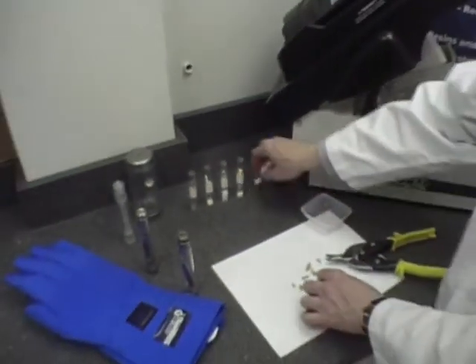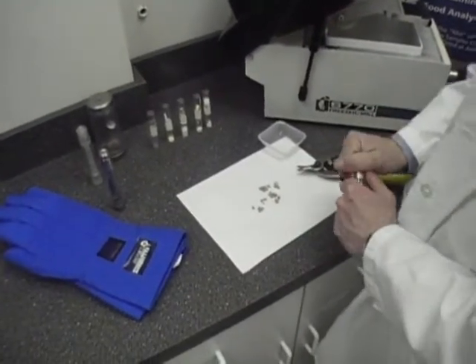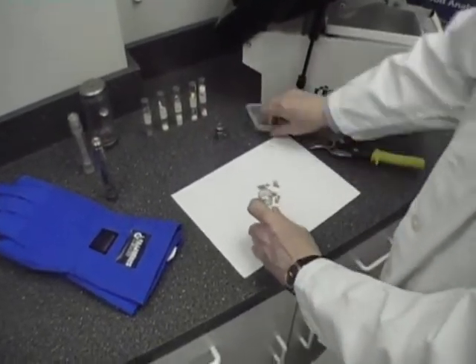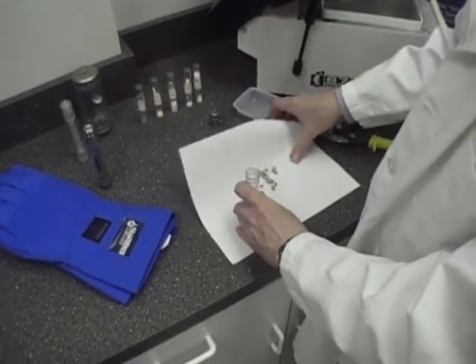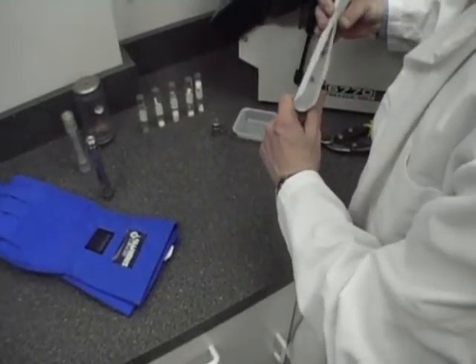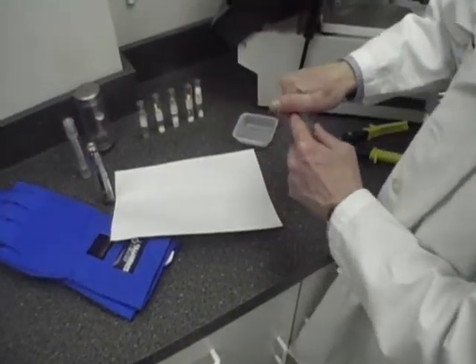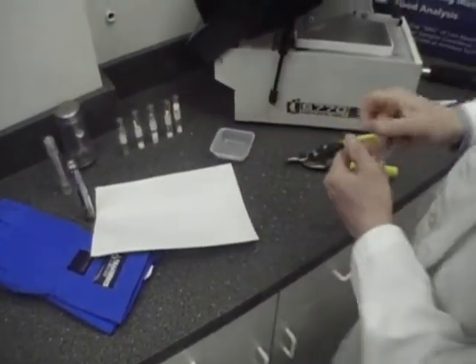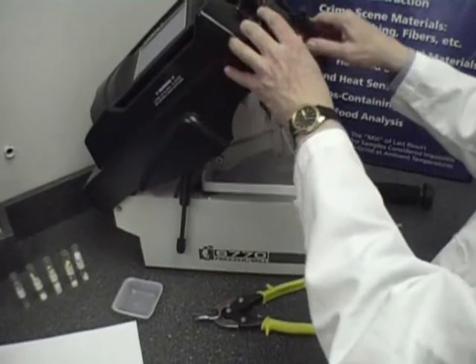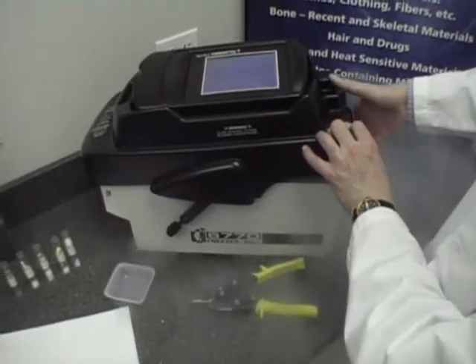So what we would do is take our chopped up sample and simply load it into our 6751 vial, replace the cap, and as you can see, it loads very easily into the electromagnetic coil. The lid is closed and the sample is immersed in a bath of liquid nitrogen.